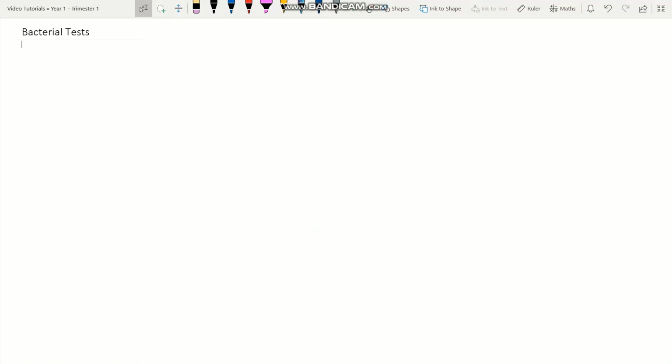Hi everyone. In today's video, I wanted to go through the different tests that exist in order to not only identify the presence of bacteria, but also to identify the different types of bacteria that may be present in a sample. Now, there are 5 different tests that I wanted to go through today. The first test is called the indole test.